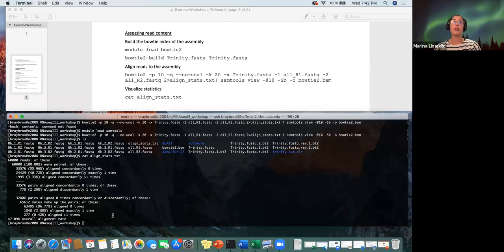So this is really bad. If this happened to your full alignment, full assembly, you would definitely reconsider. Because we're using only a subset of data, and this data is not really controlled for high or low expression, it's not really surprising that the alignment rate is bad, because we're only using a super small portion of the data that probably a lot of them are lowly expressed genes. Cool. So now we have our alignment rates.